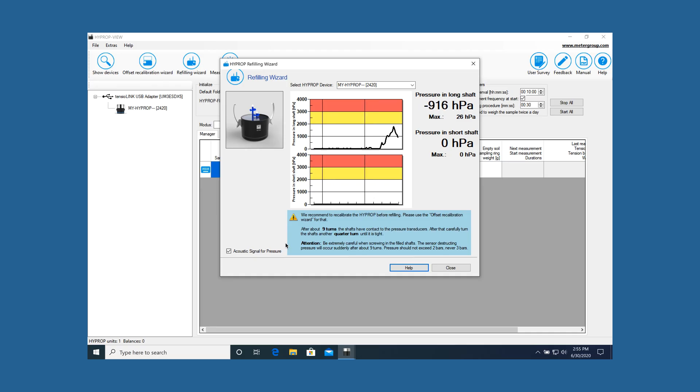Be extremely cautious when you screw in the tensio shafts filled with water. Pressure that can damage the pressure sensor increases abruptly at about nine turns. This pressure should not exceed 2000 hectopascals or 200 kilopascals, and in no case 3000 hectopascals or 300 kilopascals.